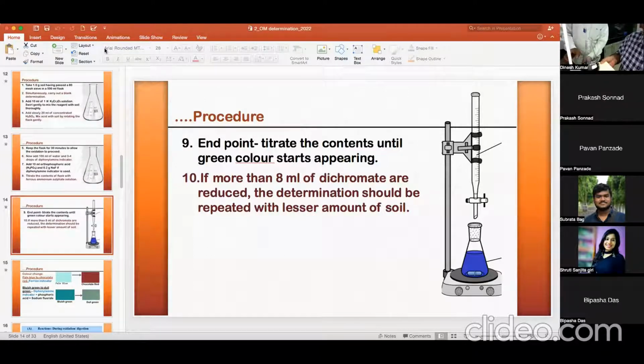All are wrong. Tell me the correct one. Now see the titration. Sir, B-U-R-E-T-T-E. Correct. And what is the spelling of pipette? Now you see he is titrating for you. P-I-P-P-E-T. Yeah, burette. Pipette. P-I-P-E-T-T. Good. Pipette.